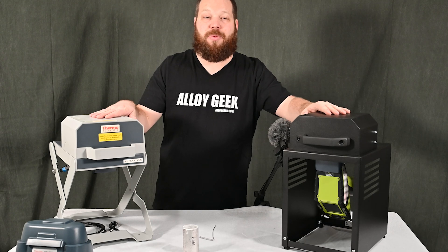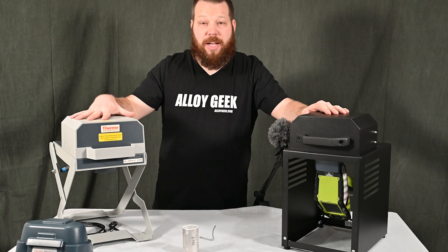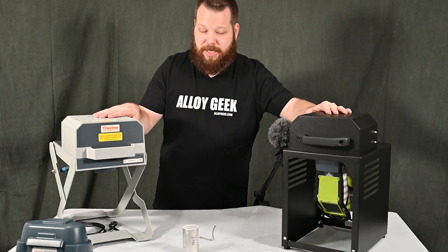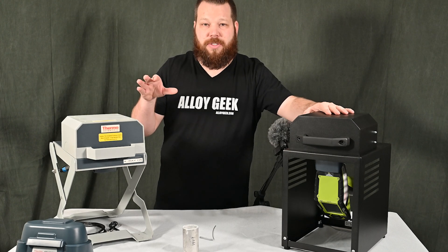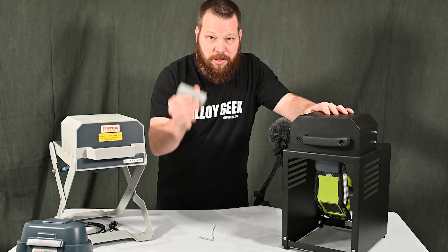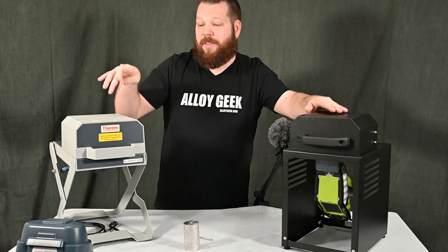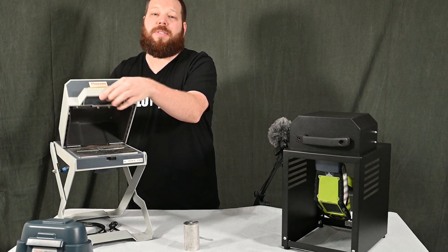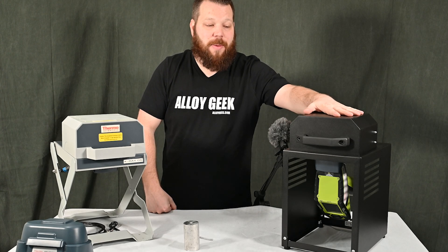Now you've seen all the test stand options available for the Niton XL2 and XL3T. It doesn't matter if you have an old model, a precious metals model, or a geological model like the XL3T — they're all compatible with these test stands. You're going to want to make sure there's a camera inside your XRF; it makes it much easier to see what you're doing on a computer screen and lets you target your sample more accurately. If you don't have one, you can always trade up to an XRF that does.